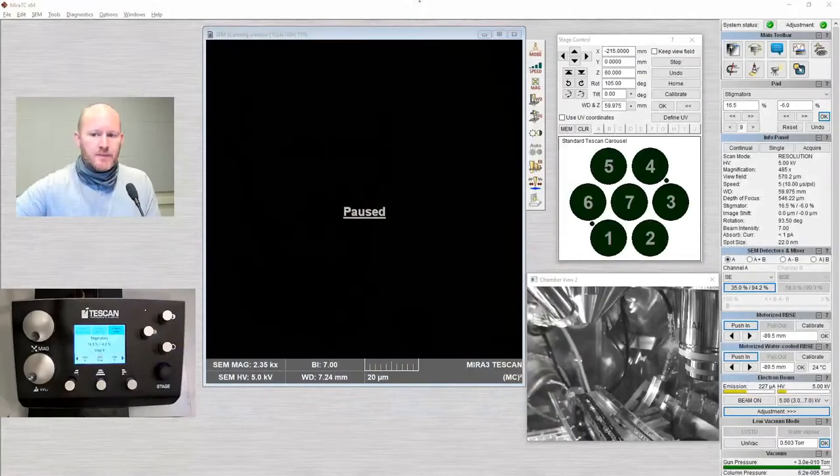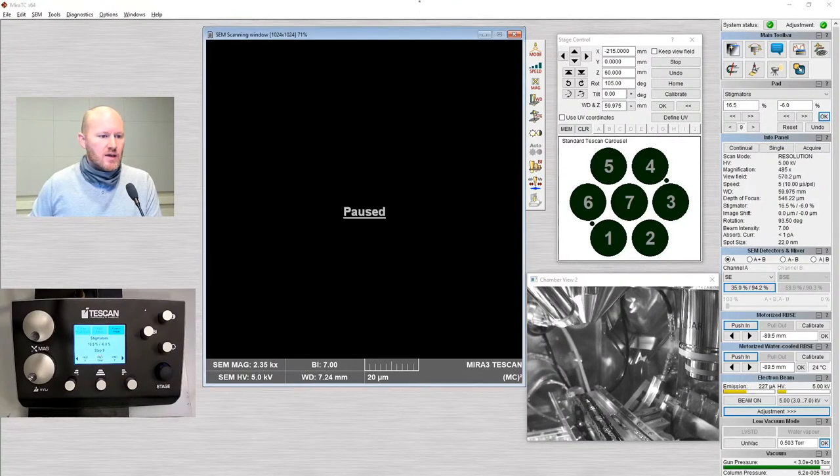We've not yet vented the chamber to load our sample. What we're going to do today is just run one of our standard samples. So first step is to vent and load the sample. I'm going to go over to the mirror software — the vent button can be found in the bottom right. I'm going to vent the chamber. Right now, if you're in the room, you may hear it — we have nitrogen entering the chamber to bring it up to atmosphere.